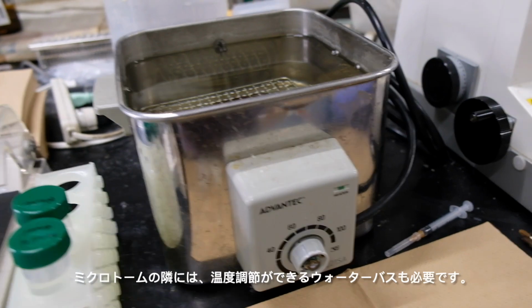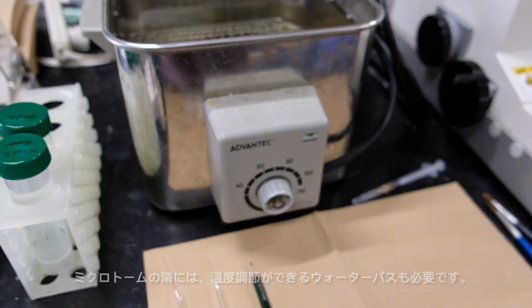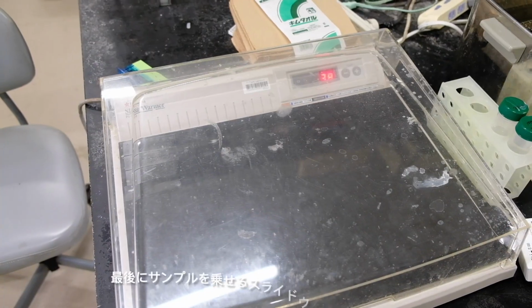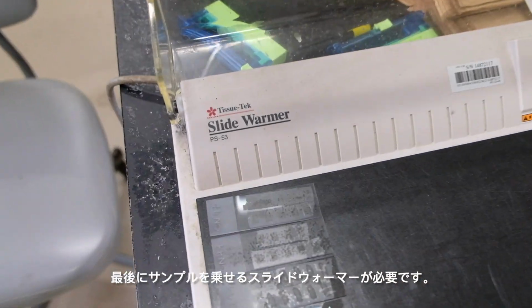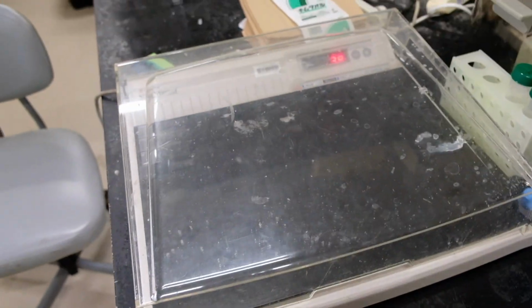Next to the microtome, we will also need a water bath that we can adjust the temperature for to put the cut samples in. And finally, we'll also need a slide warmer, which we can put the mounted samples on to allow them to dry.